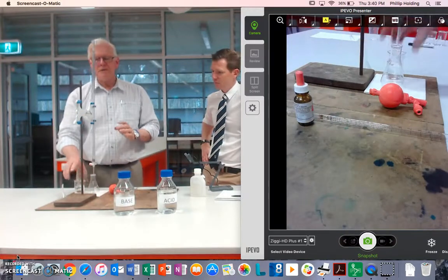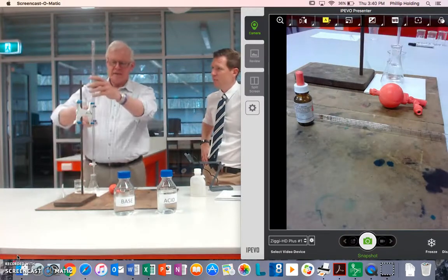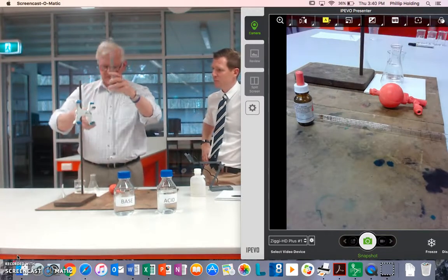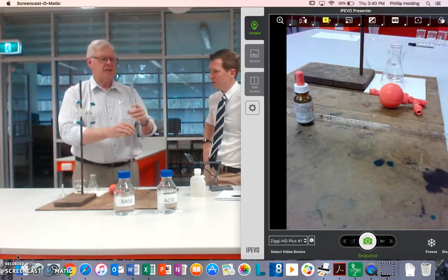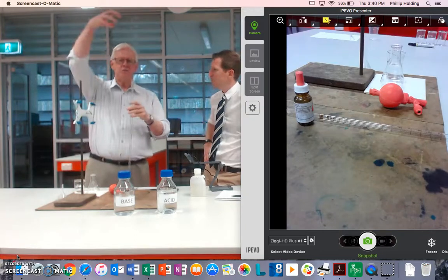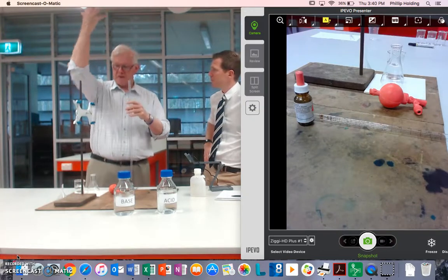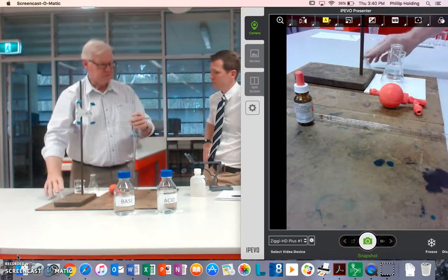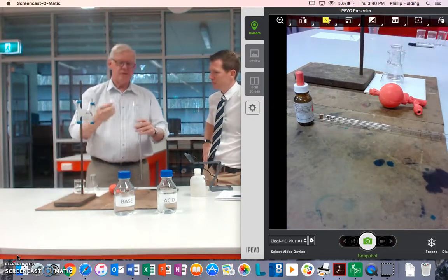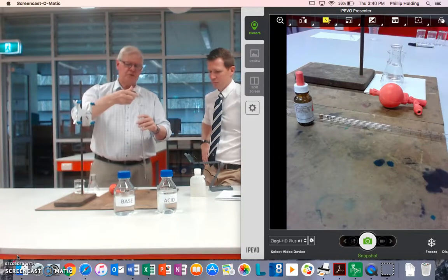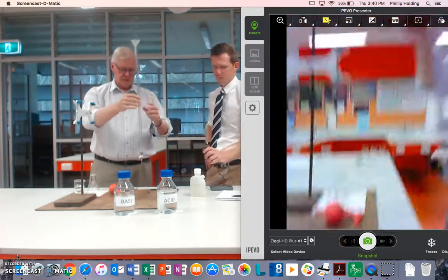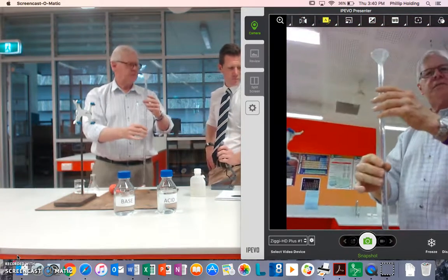Now, when you fill the burette, take it off the stand. Okay? You don't want to be stretching up and stuff running down your arms. Therefore, what we do is we get it down to a comfortable level.